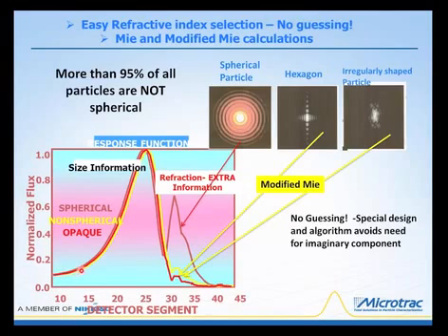And if we look at these particles, this darker color here is the fingerprint that you would find for a 6-micron particle that's spherical. And we notice that all of a sudden this particle size peak develops a secondary peak out here. Now this is a refractive component, and this is extra information that the algorithms will use to do calculations unless it's taken into account.